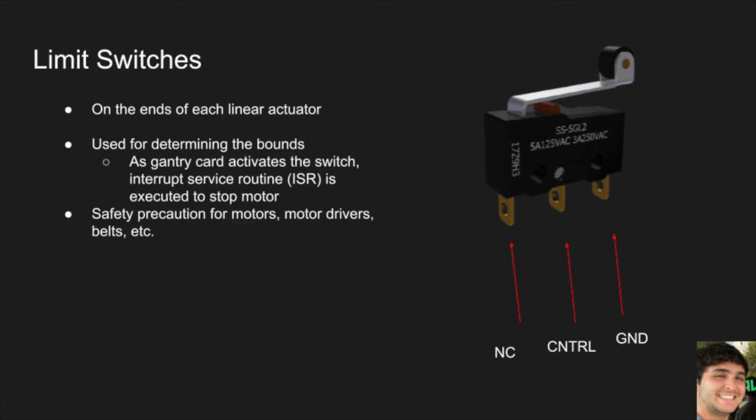After the robot turns on and the user inputs cycle data into the user interface, the robot will commence its calibration stage, where each linear actuator will move towards its limit switch. This will allow us to have some reference position in our code to accurately move to predetermined destinations for operation.